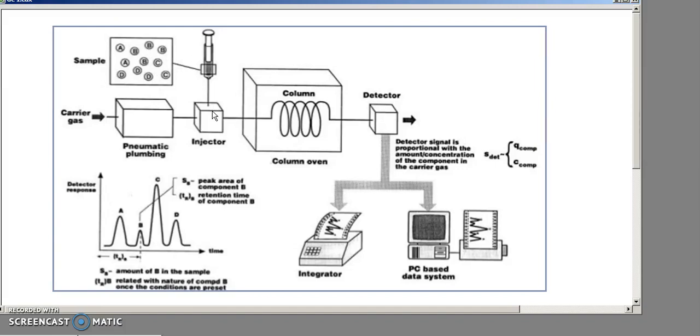There is a gas that flows through the GC - sometimes it's hydrogen, sometimes it's helium, sometimes it's nitrogen, but I believe our GC uses hydrogen. The carrier gas carries the compound mixture onto the column.